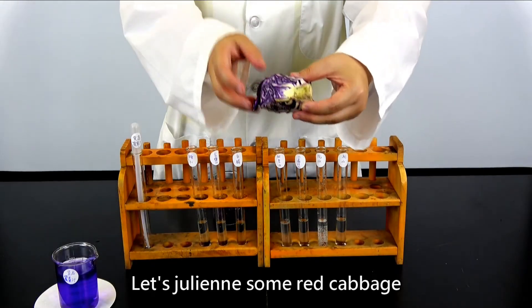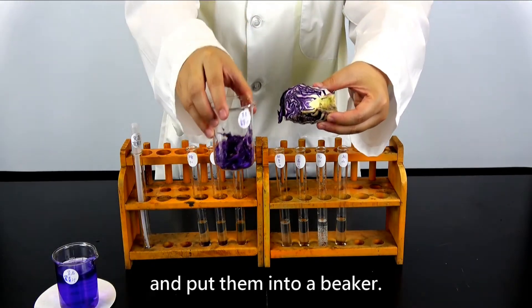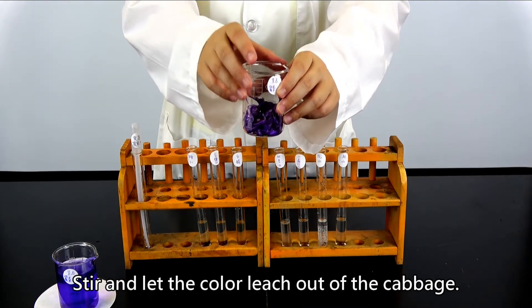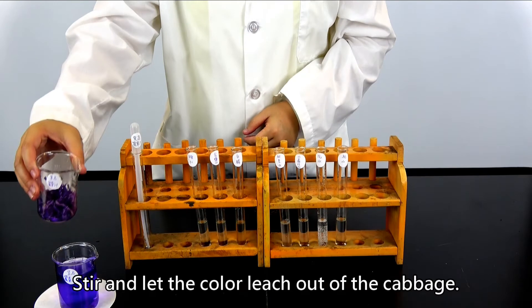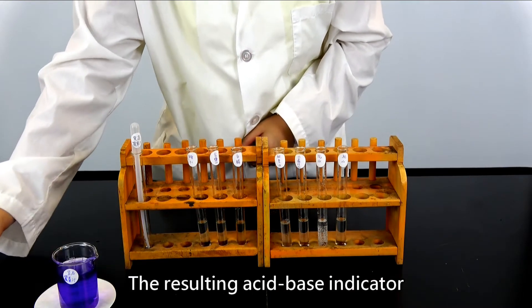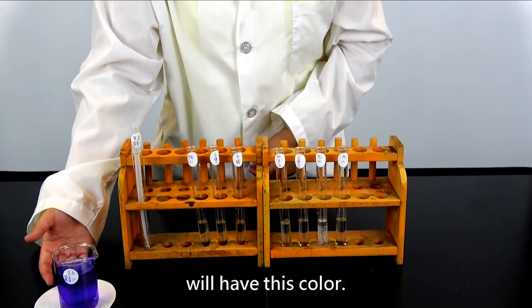Let's julienne some red cabbage and put them into a beaker, then add hot water. Stir and let the color leach out of the cabbage, then pour the liquid into another beaker. The resulting acid-base indicator will have this color.